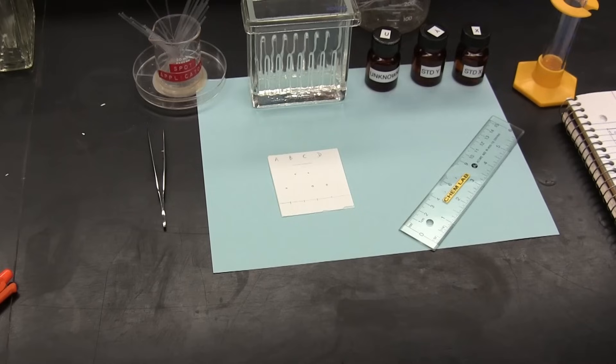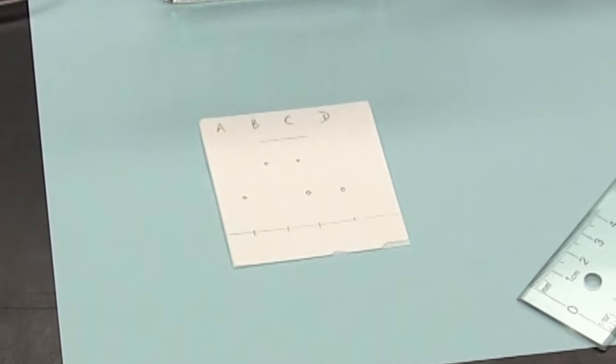And now that the plate is no longer under UV light, we can see all the spots together with the solvent front. Let's take a closer look at the results.